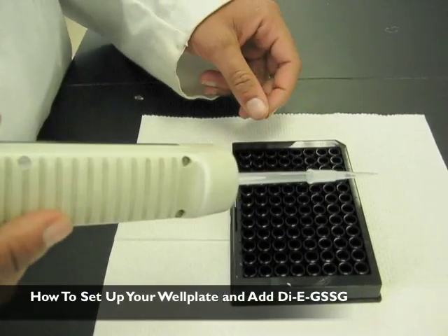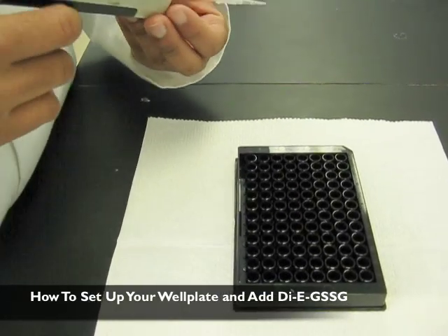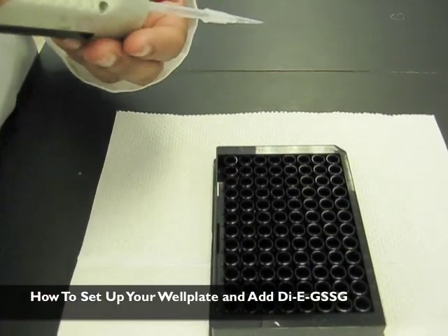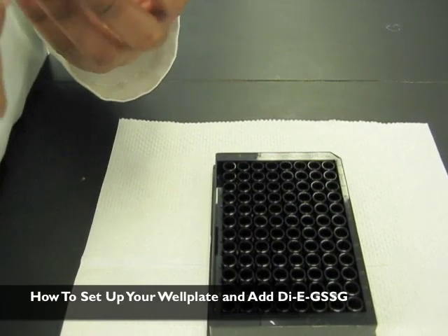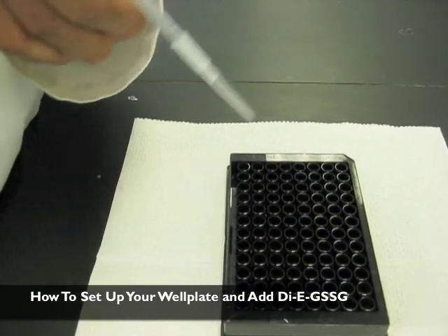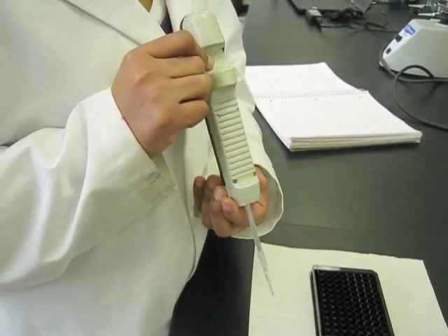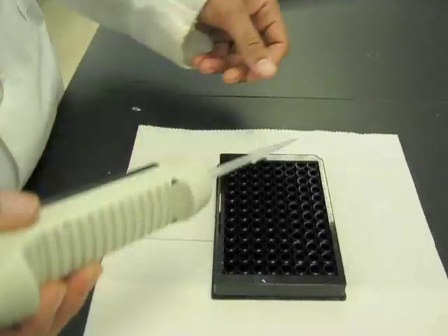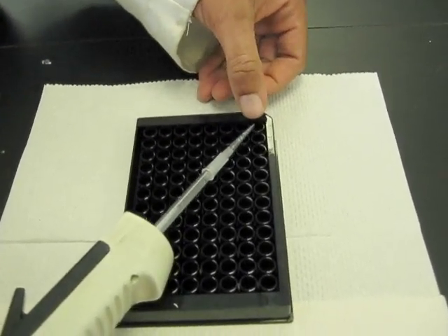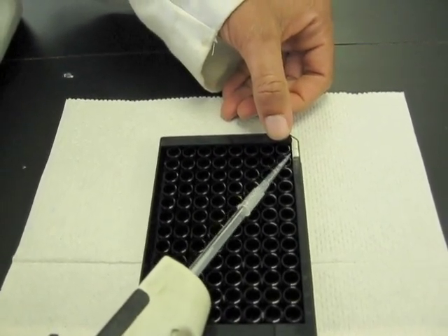We'll be working in a matrix of six by six. The thiol solution will already be in the plate, and you're going to add the di-eosin glutathione disulfide with a repeat pipetter as quickly as possible.